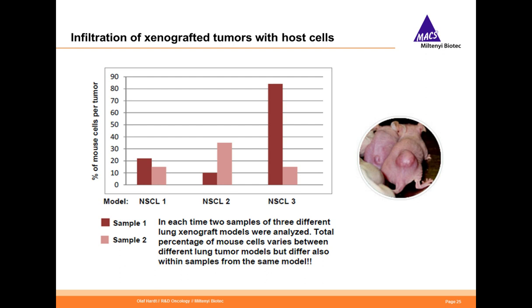However, when you graft 2 tumors in each flank, or in both flanks of the mice, you see that even these 2 tumors, which are coming from the same patient tumor, have a very heterogeneous degree of infiltration. So if you would do, for example, a molecular analysis out of this, you would have a very influential bias towards the number of infiltrating mouse cells for your downstream analysis, cell culture, molecular analysis, Western blotting, everything you want to normalize your actual target cells towards the starting material.